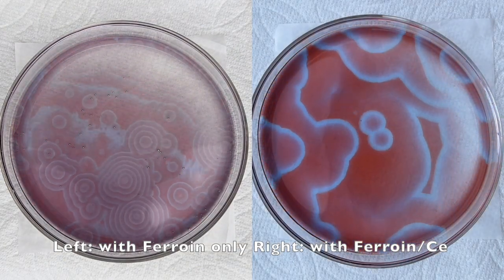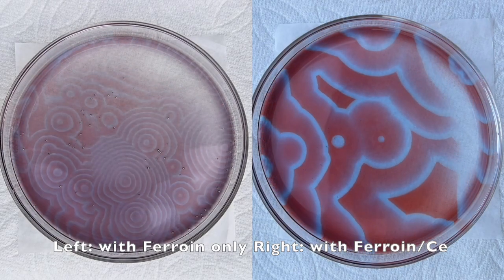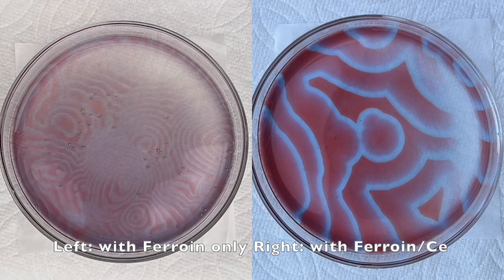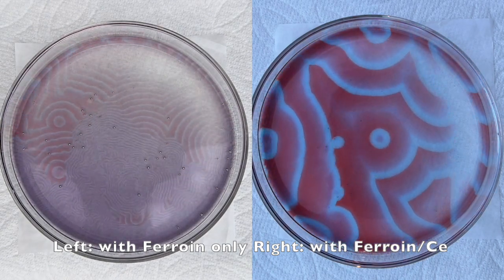The reaction on the left only utilizes ferroin as its indicator, while the reaction on the right uses both ferroin and cerium. If you haven't seen the previous episodes yet, I would highly recommend you to see them first.